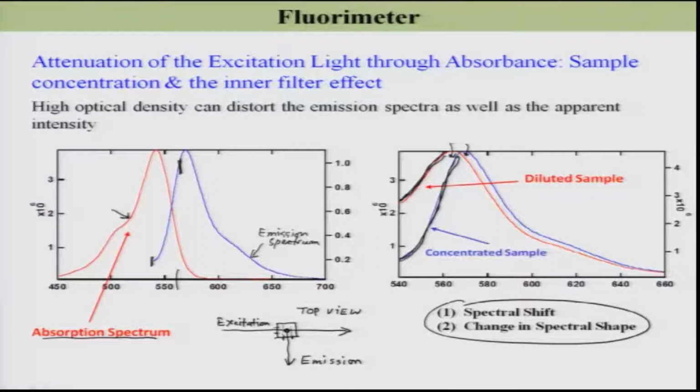So, we need to be cautious while measuring this emission spectra. Measurement of an emission spectrum is not trivial, it is difficult, I can tell you. It is not like absorbance. Absorbance is fine because it is just a ratio I0 by I, take a log, plot it versus wavelength, but in this case it is not like that. So, you need to really take care of different aspects, right.